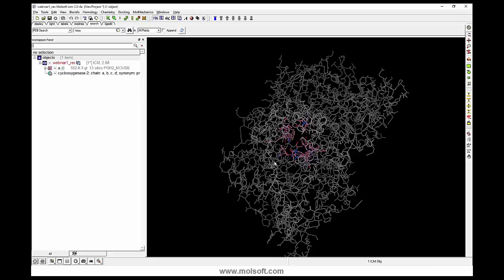So you had a question: in the presence of the ligand, will the pocket site vary? Yeah, maybe we can go over that again. The most important thing is that you move the ligand out of the pocket and you have two separate objects for docking, but for the pocket finder you don't have to worry too much. It ignores the ligand, or you can include it and then you'll see a different pocket and you might see a space away from the ligand to dock into.